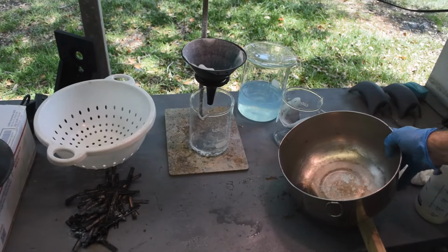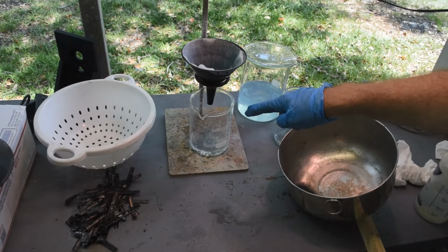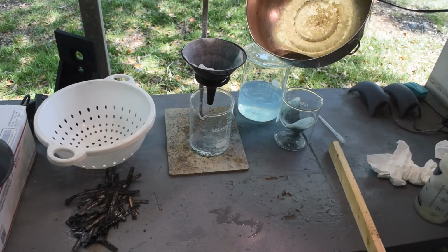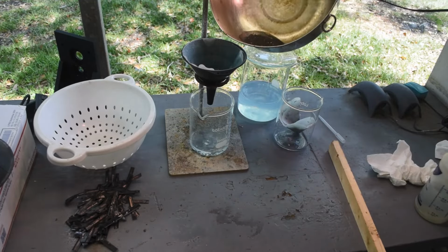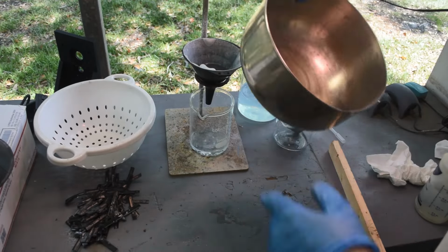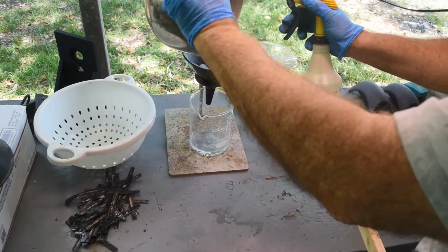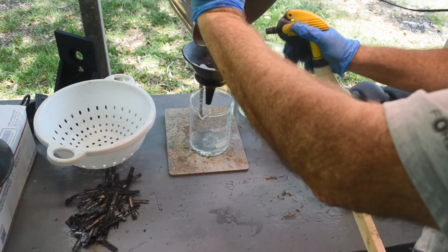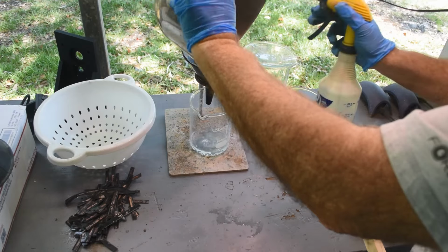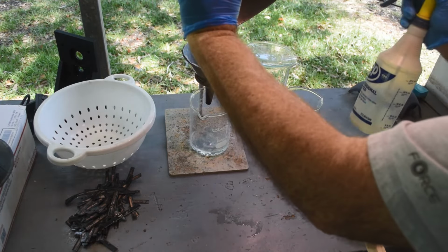Okay, so the bulk of the liquid has gone through. It's over here and in here. I've got the last little bit in here that contains the bulk of the solids. I'm going to put this in. I do it this way just to keep the solids from clogging up the filter and making filtration take forever. So there we are. I will just let this stuff run through.